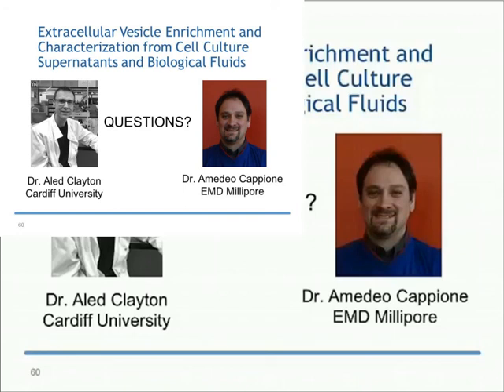We did do some experiments back in 2004 when we had exosome-coated beads, and we were adding them to cells and measuring calcium signaling responses in response to exosome cell surface contact. The exosomes were immobilized on the surface of beads, which were held by a micro-injection needle onto the surface of the cells, and the cells would signal beautifully in response to this contact. So there's an example where the affinity hasn't really had an impact on the exosome function. Again, it's very difficult to give a general answer for this. It'll depend on what you're pulling them down based on and what you're measuring in response to that.